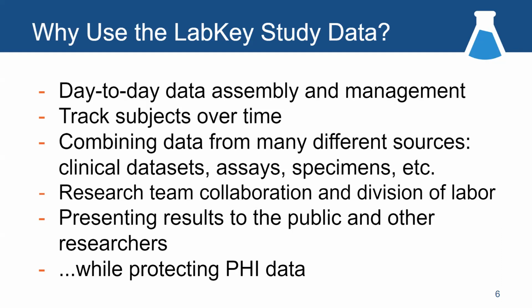There's lots of process around this kind of data. And so you really need a central place for the data to collect and funnel, get all your eyes around it, collaborate around it, discuss it, decide where you're going with it, what you want to do with it. So as just a day-to-day tool, it's a great tool.